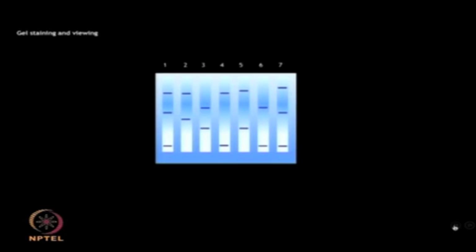The gel can then be stained with Coomassie brilliant blue and viewed to observe various discrete protein bands. After watching this animation, I hope you are able to understand how to perform native polyacrylamide electrophoresis, and these concepts can be applied for using 2DE as well.